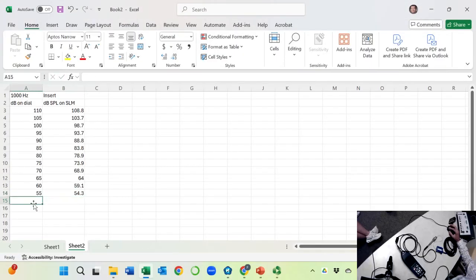Okay, I'm not going to go further. If you go down to very low levels, you deal with background noise. That's a different issue. So let's not deal with that muddy thing first. Let's keep it simple.